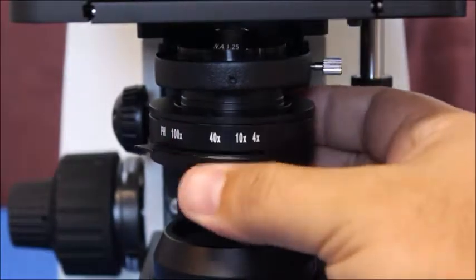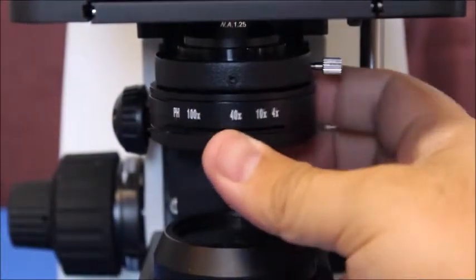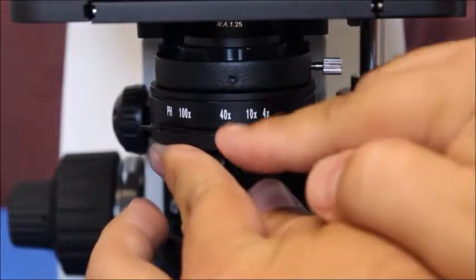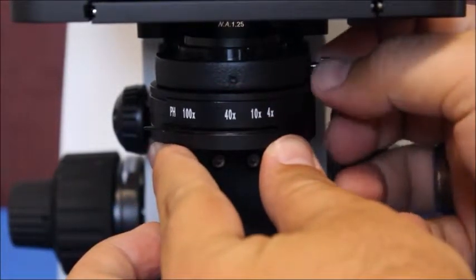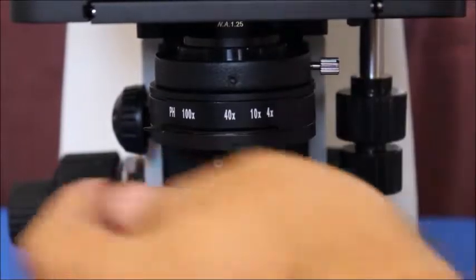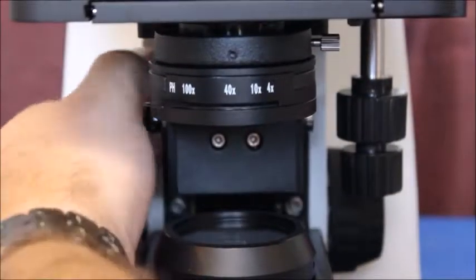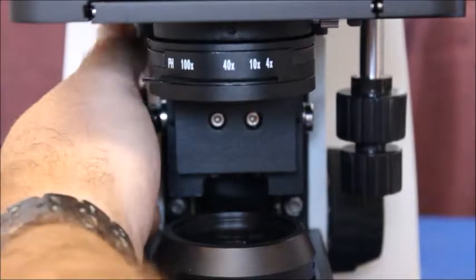Now we're just going to take this, again line up the 40x with this little hole right here. Tighten it down and you're good to go. Just finger tight is fine. You can raise it back up.